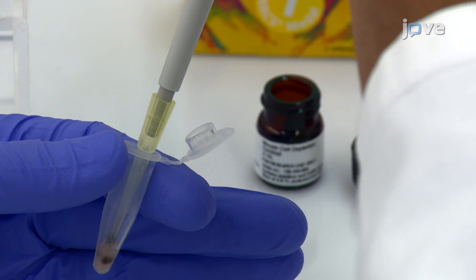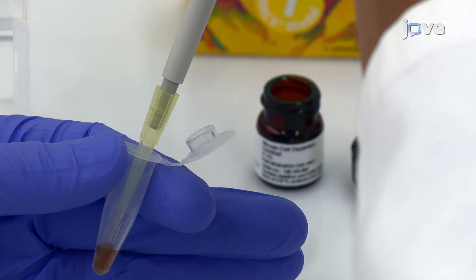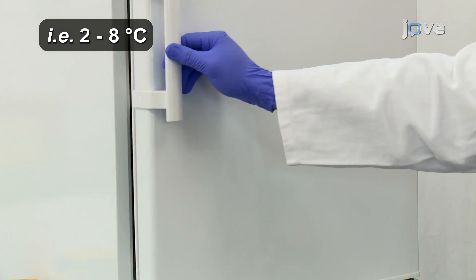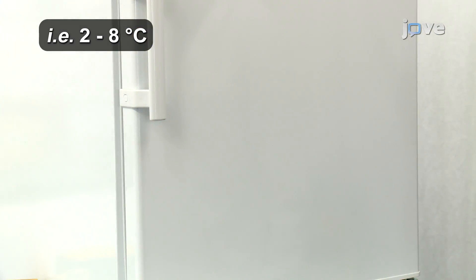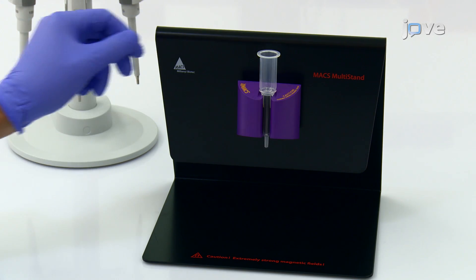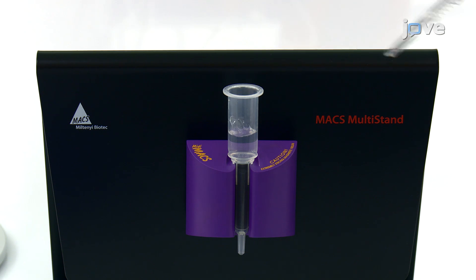Next, mix 20 microliters of magnetic labeling reagent for mouse cells into the cell suspension and incubate the cells for 15 minutes in a refrigerator. While the cells are being labeled, place an LS column into a suitable magnet and rinse the column with 3 milliliters of PB buffer.